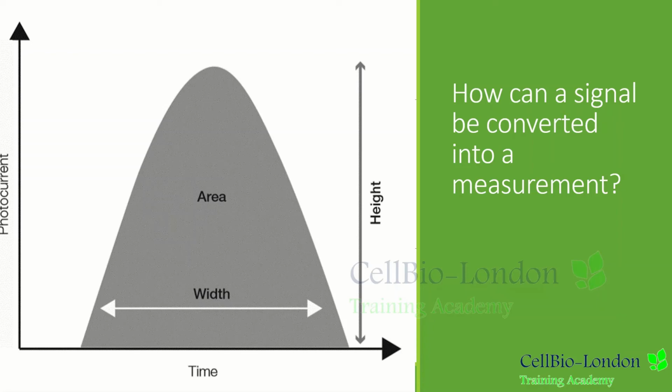The output of the PMT detector will begin to rise, reaching peak output when the particle is located in the center of the laser beam. At this point, the particle is fully illuminated, which means the laser beam's photons are at highest density and will produce a maximum amount of optical signal. As the particle flows out of the laser beam, the current output of the PMT detector will drop back to the baseline.